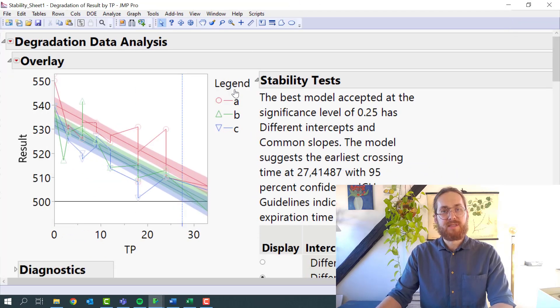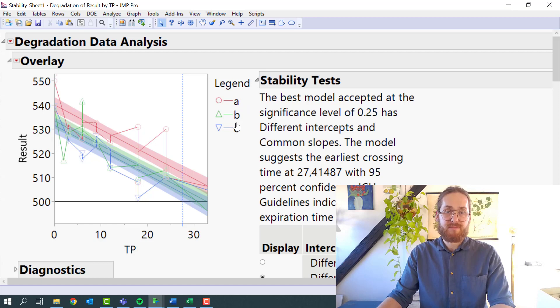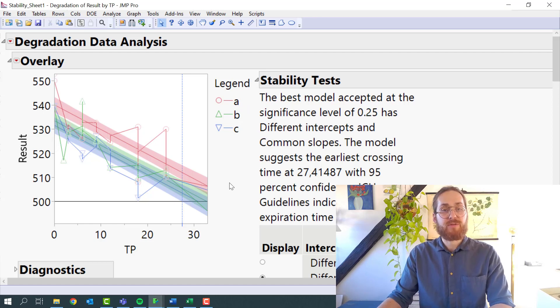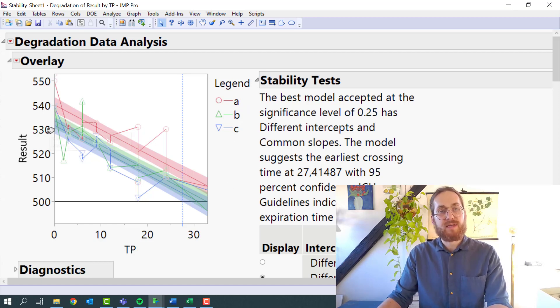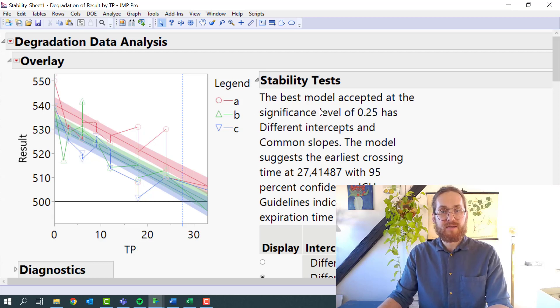Now I can see that my three different batches have been given three different colors. I can see that they are at different starting points. I can read over here that it has different intercepts, but common slope.